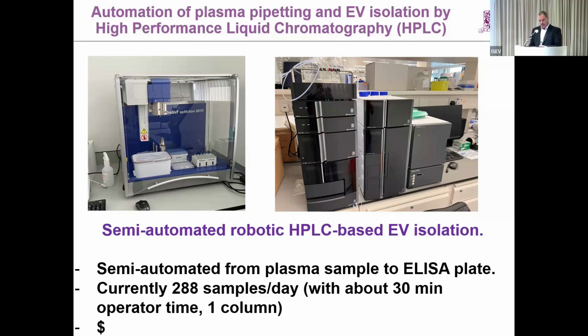Now, I want to finish this off, and we do a lot of this development in the lab, but as soon as you actually go into this kind of development, you will have a lot of interface with companies. And one of the companies approached us whether we can actually help developing an immune affinity device. So similar to the corona tests we all learned to love a few years ago, for low sensitivity, low specificity, black and white detection. And it's a point of care device that nurses or doctors could load the blood, and we can actually detect our EV marker or the company's EV markers there. So there are different ways.